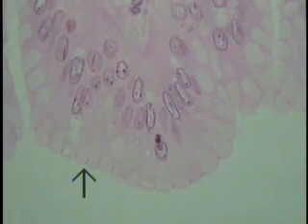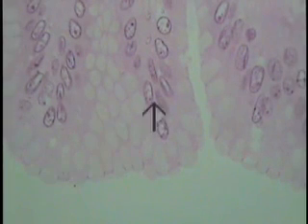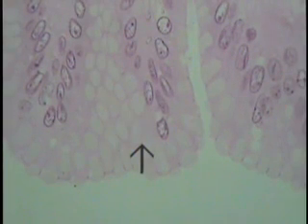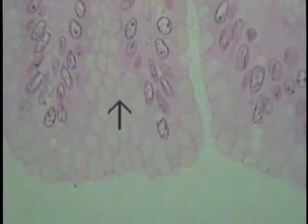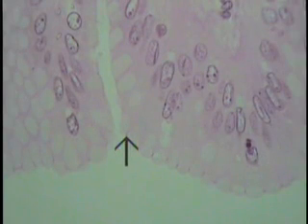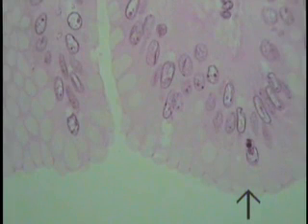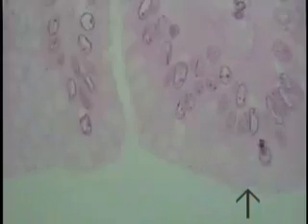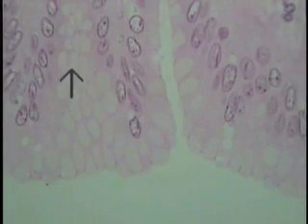Another feature that should be demonstrated to you is when you encounter a field such as this. If one can envision, these are the apices of several cells as if you were looking down on them from the superior level. If one envisions a section such as this, as indicated by the pointer, the cut coming through the tops of these cells, and then flipping it over and looking at it, this is the type of honeycombed appearance or field one would obtain.